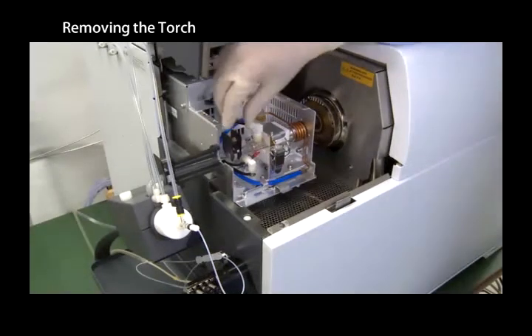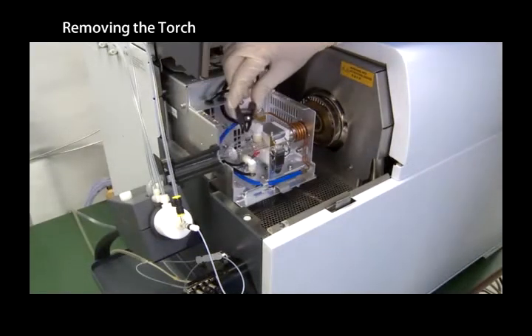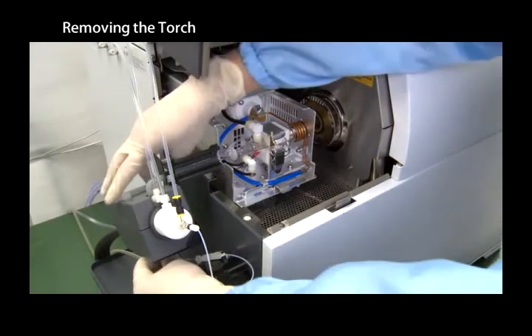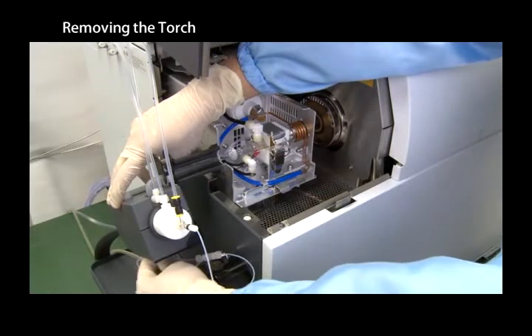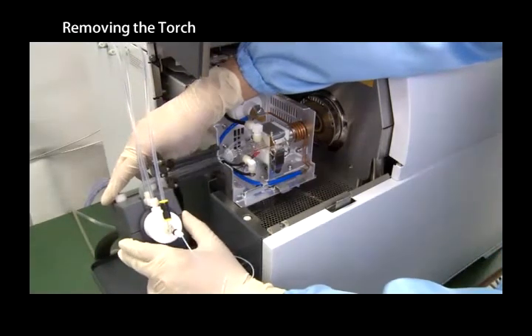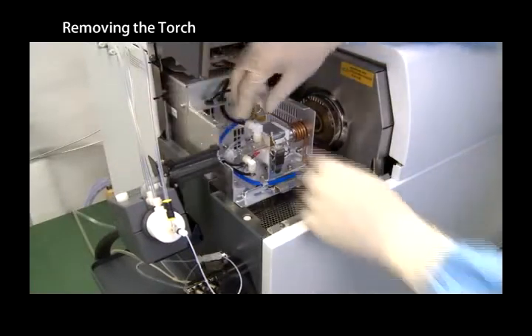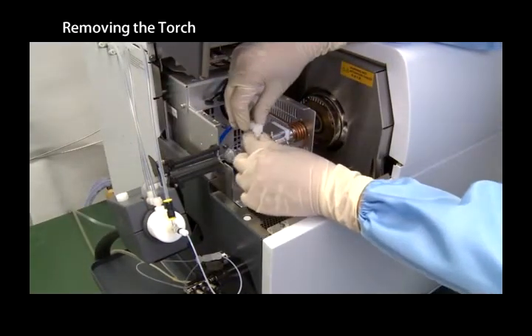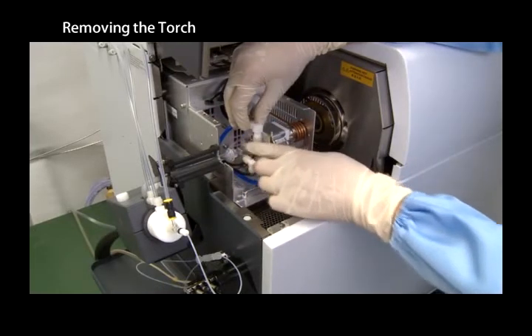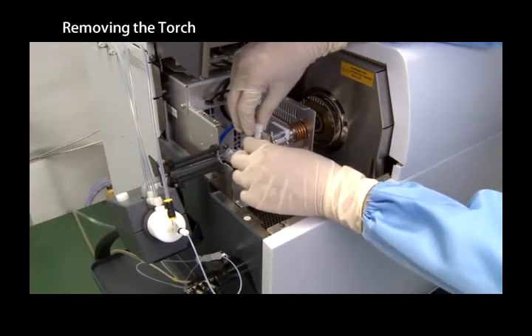Remove the clamp on the torch side. Loosen the spray chamber block thumb screw and then slide the spray chamber block to the left. Loosen the plasma and auxiliary gas tube connectors and then disconnect the tubes from the torch.